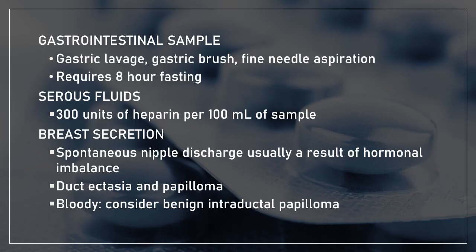Then you have your gastrointestinal sample. You have your gastric lavage, gastric brush, or fine needle aspiration. Accordingly, it is just the same as the collection in your respiratory specimen. But for gastrointestinal samples, it requires 8-hour fasting.